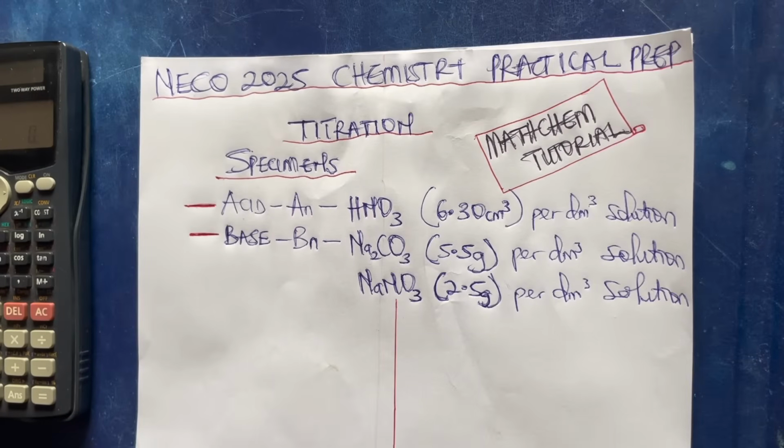In this video, we'll be looking into NECO 2025 Chemistry Practical Preparatory. This is the titration aspect, also known as volumetric analysis. These are the specimens we'll be needing for the titration part.